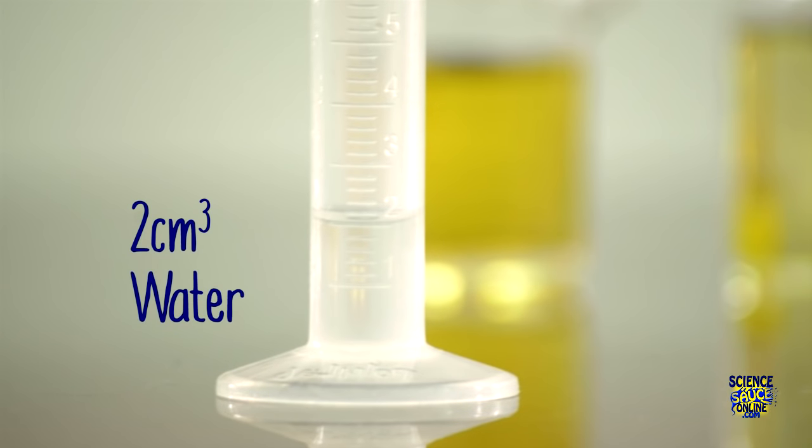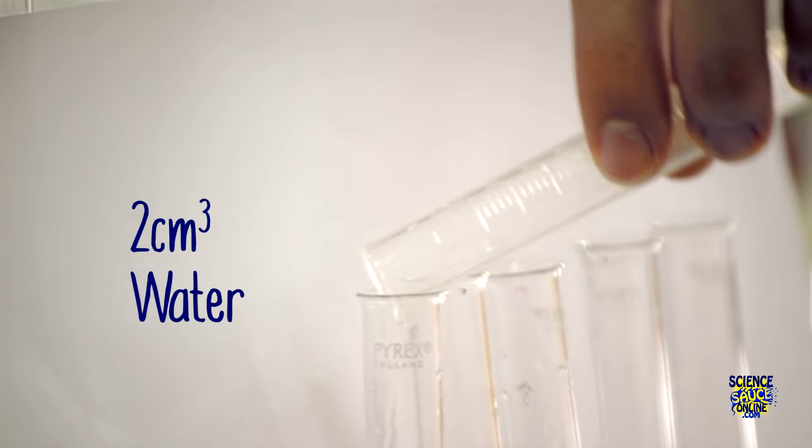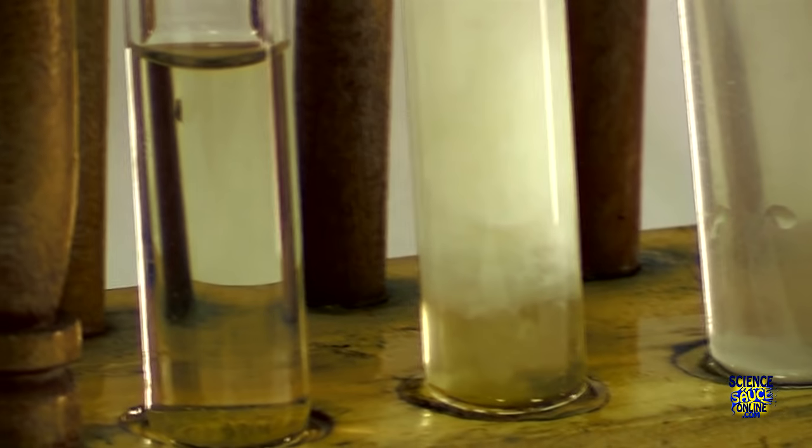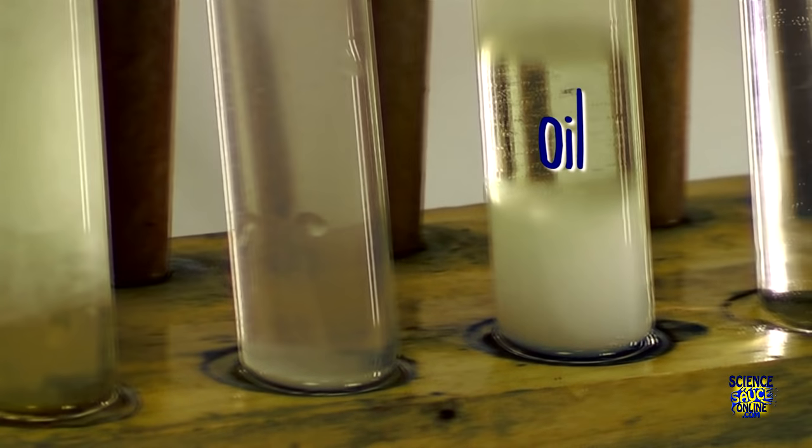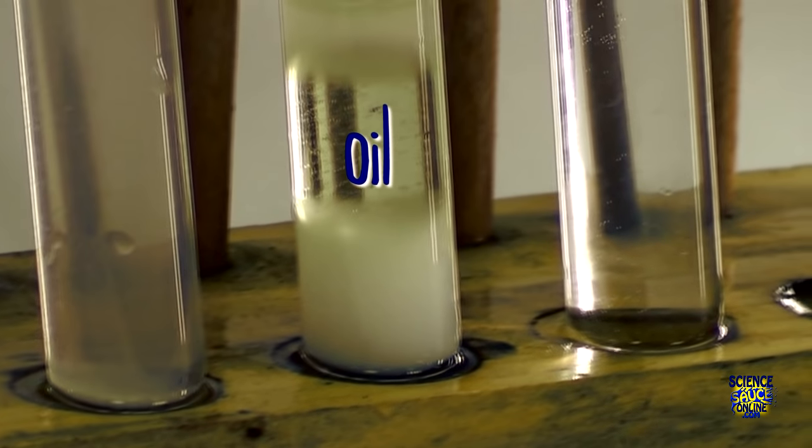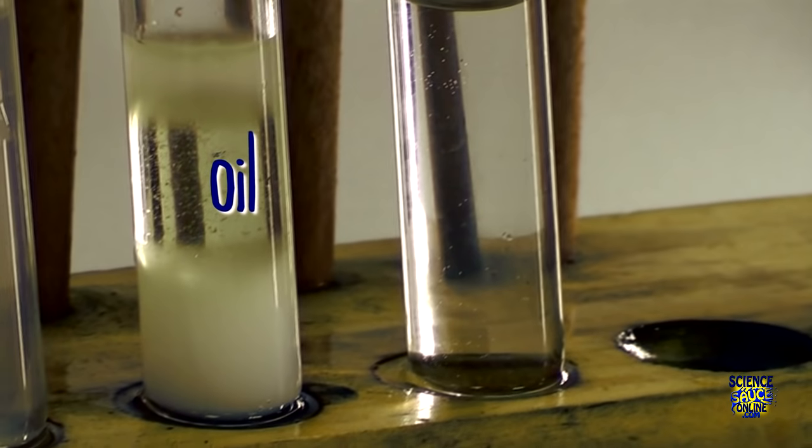After you've shaken your samples add two centimeters cubed of water and then observe the changes. Here in our oil sample you can see this sort of white cloudiness formed. This is what's known as the emulsion.